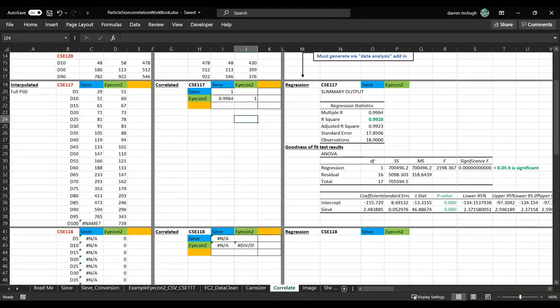But what does that really mean to us? We can actually see there's a relationship between the two of them. But does it matter? Is it statistically relevant? Correlation is great as the first step. It'll be part of your story toward your analysis. If you see a positive value like this, or if you see something negative, or something below 0.5, you would see a moderate relationship between the two values. It would be showing that there are issues, that these two sets of data have no relationship to each other. That could be for several reasons, but we won't get into that now.